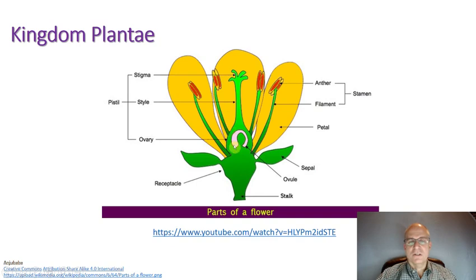And then we've got the pistil, which is the female part of the flower, and it's made up of the stigma. So think of the sticky stigma, because the stuff on the surface here is sticky, so when pollen lands on it, it doesn't blow away. The style, which is the long tube, is going to connect the stigma with the ovary in here. And if fertilization happens, if pollen lands on the sticky stigma and it travels down the style and fertilizes an egg cell in the ovary, you will see the embryonic seed in here, and this can actually grow into the fruit from the ovary.